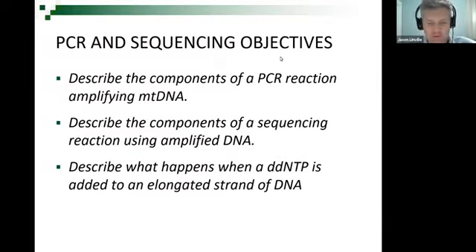This lecture is being recorded for CJ 352 Forensic Science Lab 2. This is part of the mitochondrial DNA lecture. This is the part where we talk about the analysis, specifically the amplification and the sequencing of mitochondrial DNA.